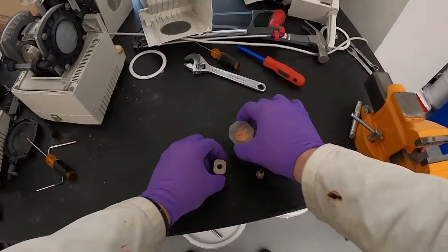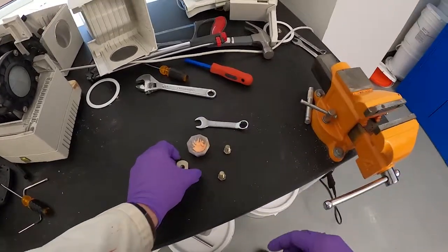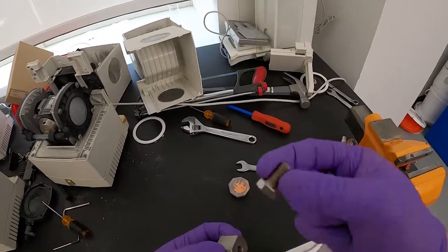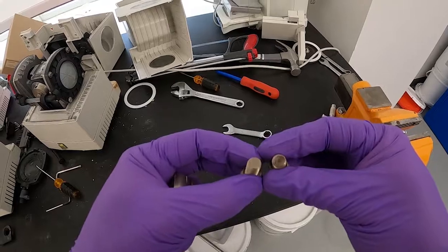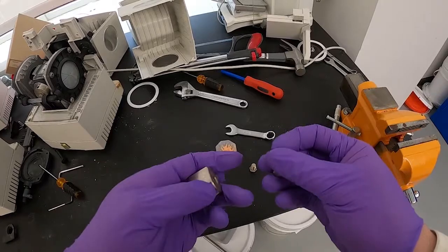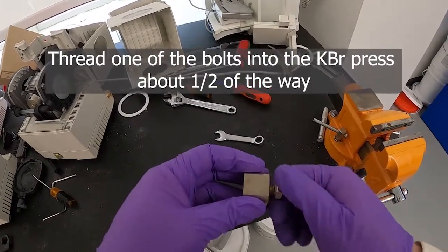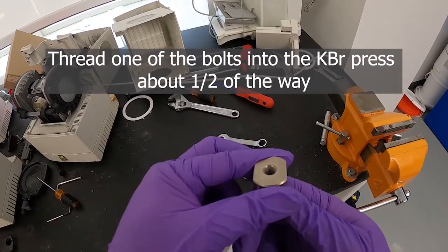I've got my KBr mixture here ground up nice and fine, so we're ready to load it into the press. Here's the press body — it's a simple chunk of metal with threads going through it. We've got two bolts with a nice mirror finish on their ends, which is important because otherwise the KBr glass pellet we make wouldn't be smooth enough. The first thing we need to do is thread one of these in until it doesn't want to go any further.